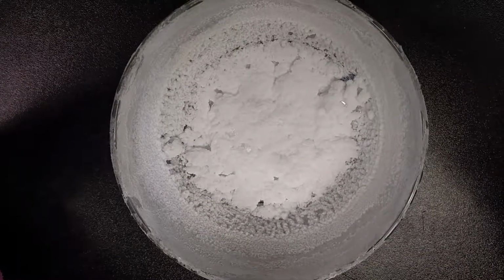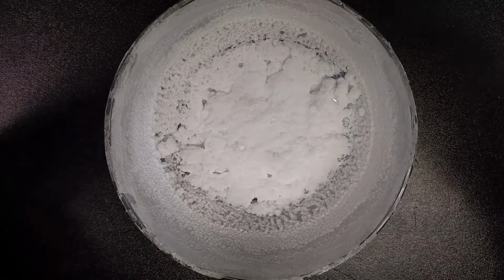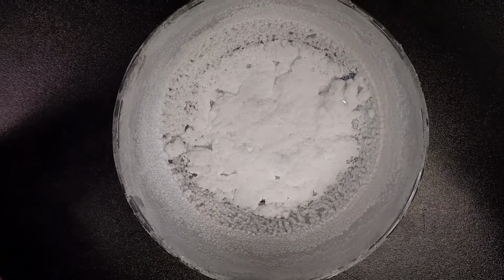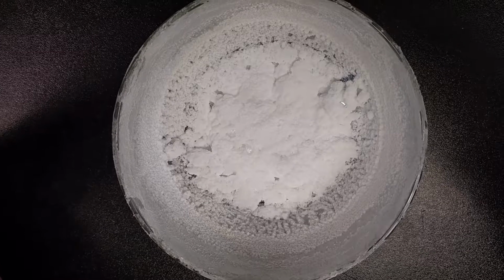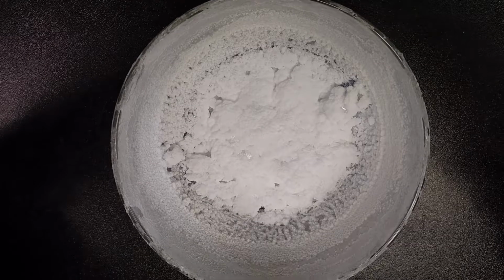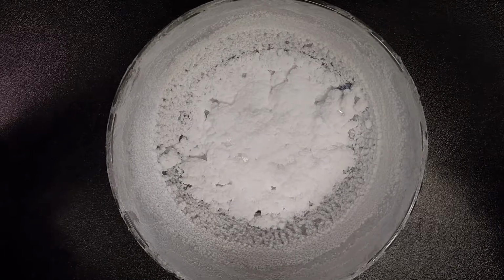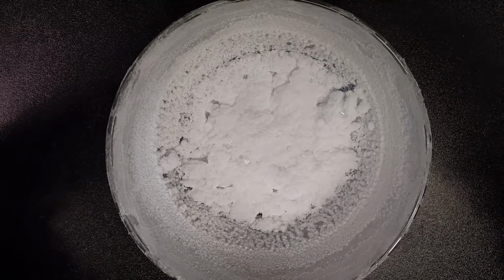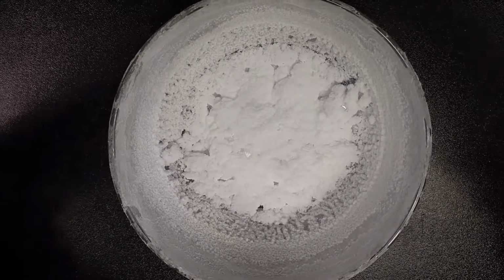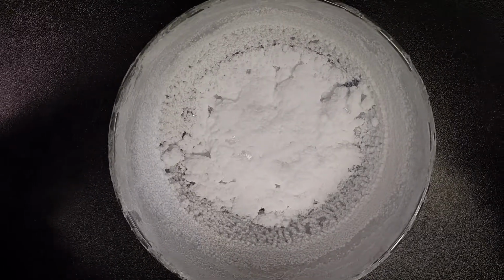Alright, so what we have here is the remains of our saltwater solution. And we have left over just the salt itself. But the interesting thing about this is that the salt transforms into little crystals once the water has evaporated. And this again takes several days, even underneath the heat from the heating lamp. So again, it's perhaps a good thing for your students to come back on a daily basis and just check the status of their saltwater solution.